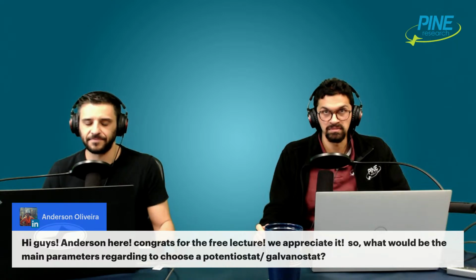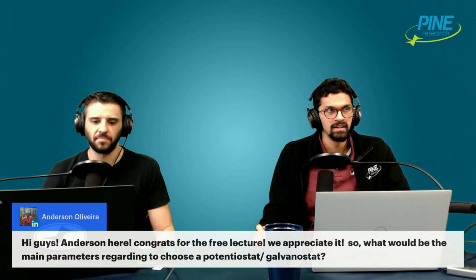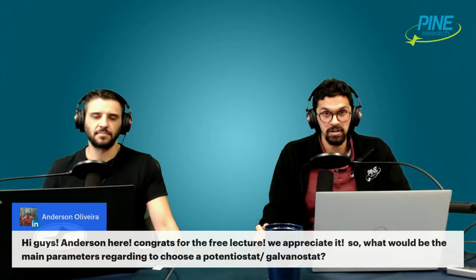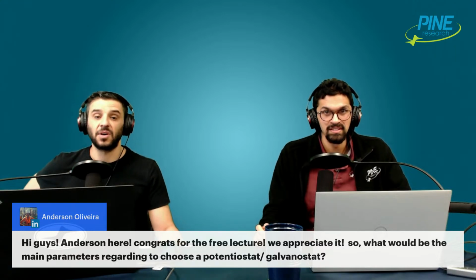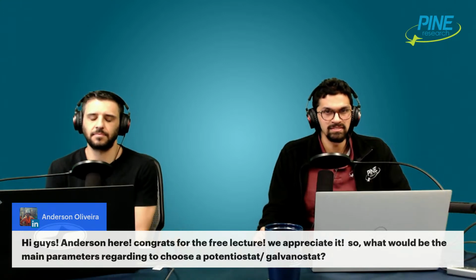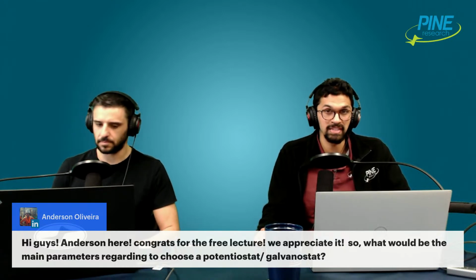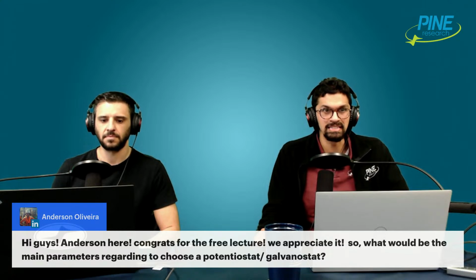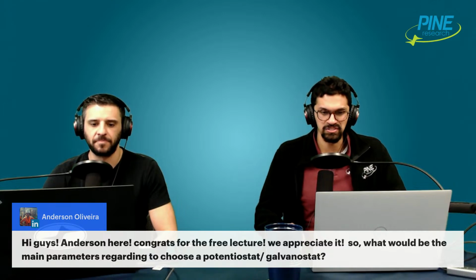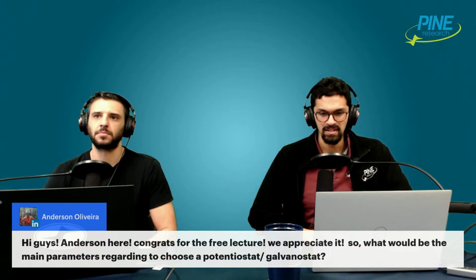Oh yeah, I think you covered all the major points. I think honestly, one thing that I think Neil can attest to, one thing that we hear a lot of people talk about is data management. People are being able to perform and automate tons and tons of experiments, generate tons and tons of data, and write scripts. So being able to export your data in an easy manner that allows you to analyze it is also an important feature. Yeah, for sure. So that's one thing I hear a lot about.